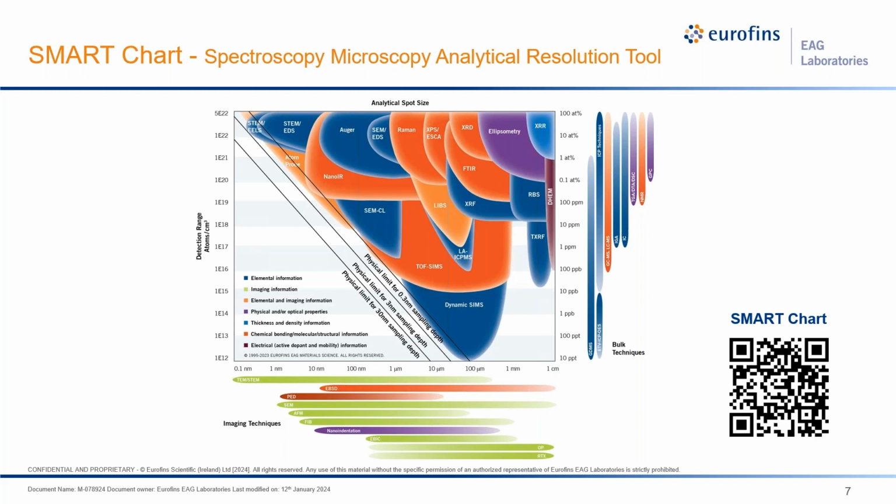So depending upon the size of analysis, and usually you would normally think about that as how large of an area. Here it really means how small of an area can you analyze exclusively to be able to get chemical information, get molecular information, to get size and elemental compositional information. This is the spot size down on the lower x-axis.